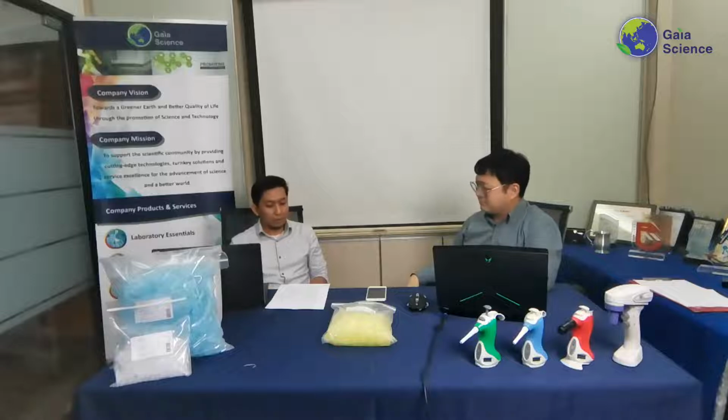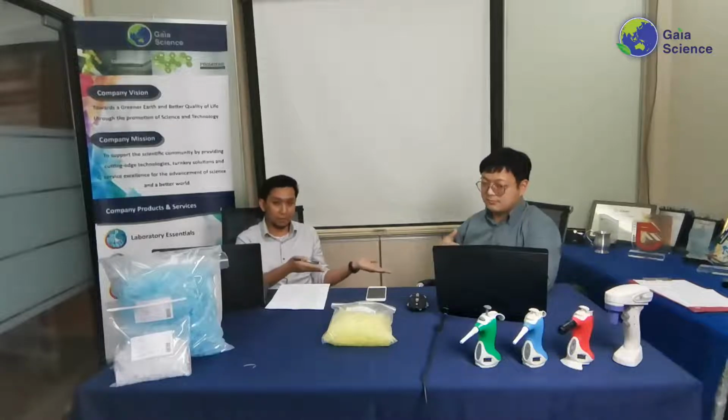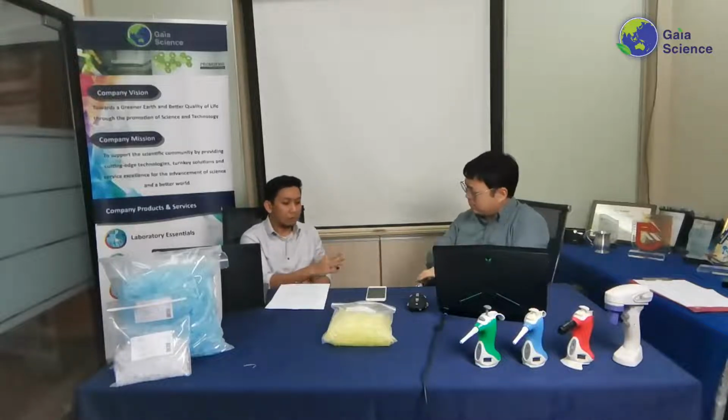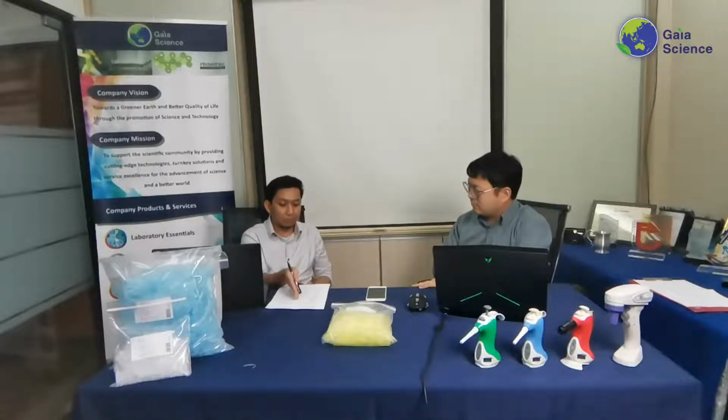Betul. Yeah. I guess what we can conclude here is that yes, true, you can get bulk tips, autoclave them, and get sterile. But you have to bear in mind, as mentioned, correct me if I'm wrong, that what you're autoclaving might not be 100% sterile. And if let's say something goes wrong, you will end up spending more to redo your experiment.